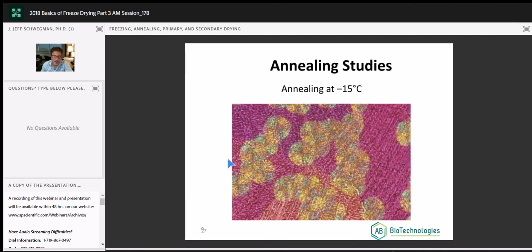Now, if I warm the sample up and anneal it, now we start to see these bursts of color come in. And great. That tells me, as we've warmed up, we've caused that metastable glass to crystallize. Now the crystals are birefringence that we talked about last time. Now we see these alterations in color. Great.